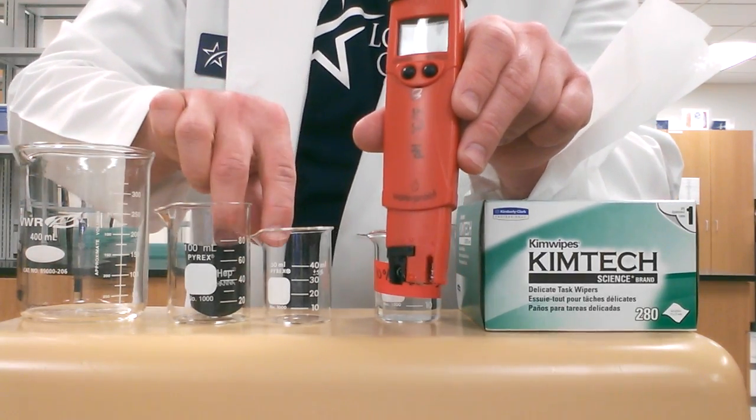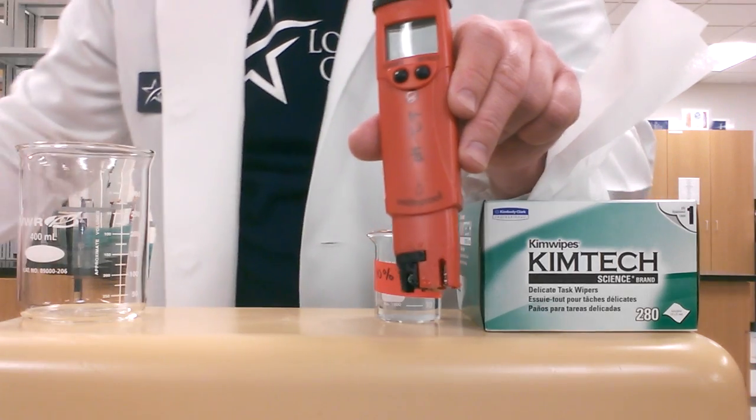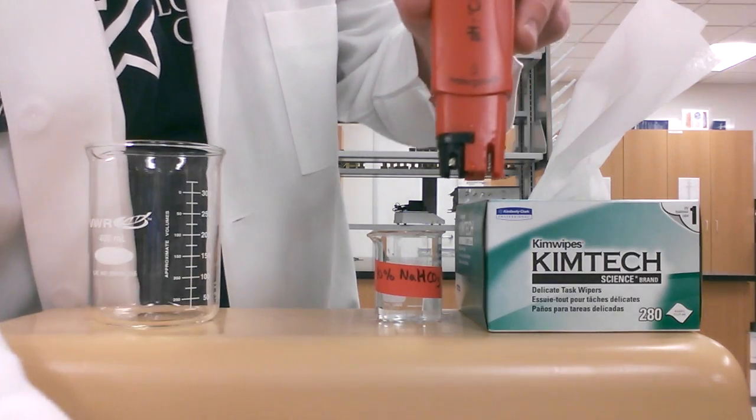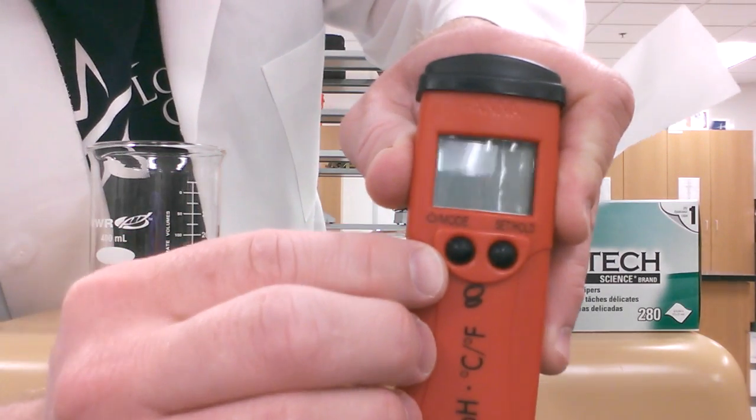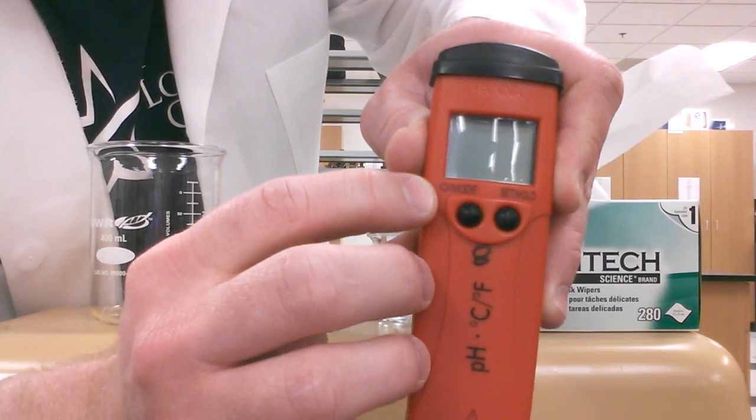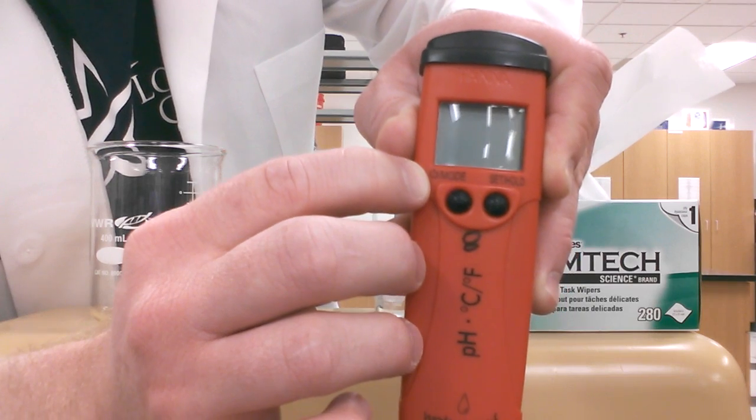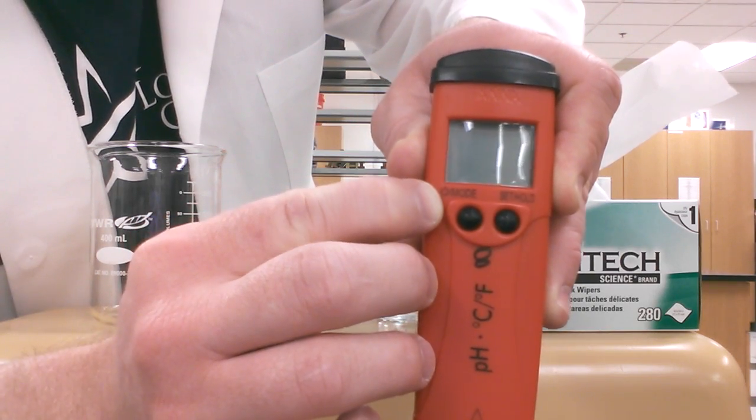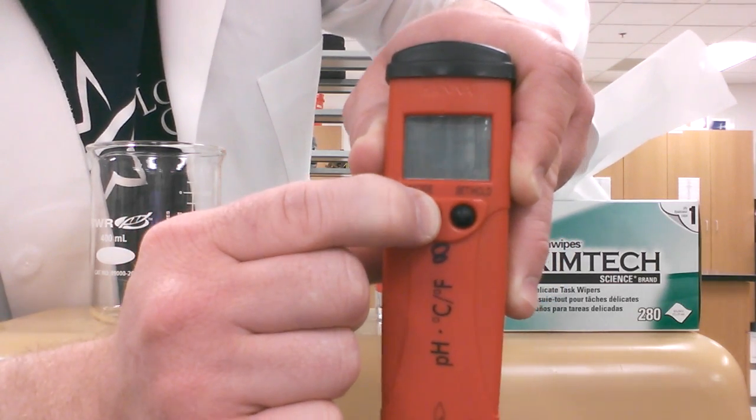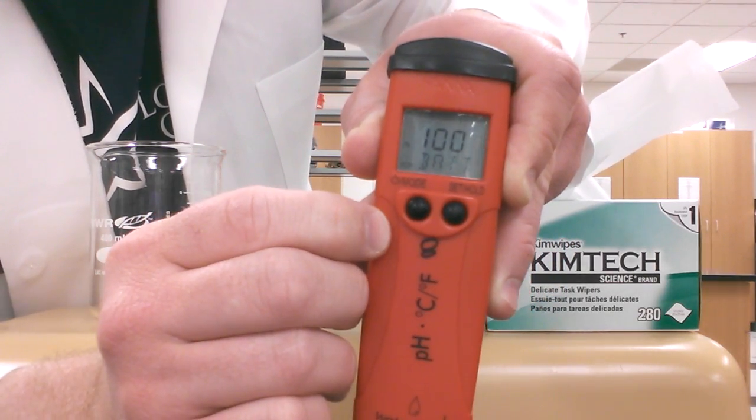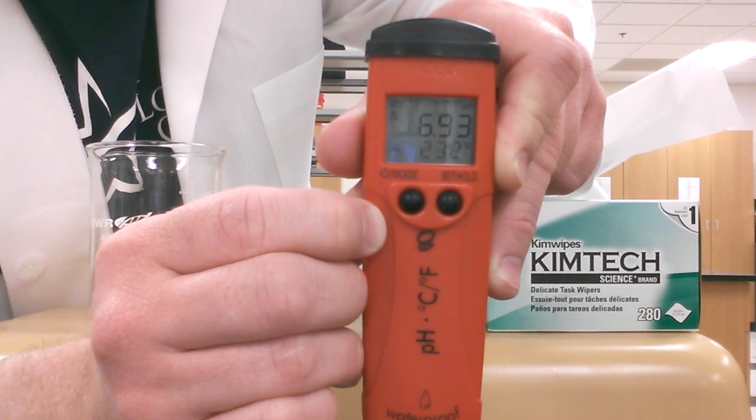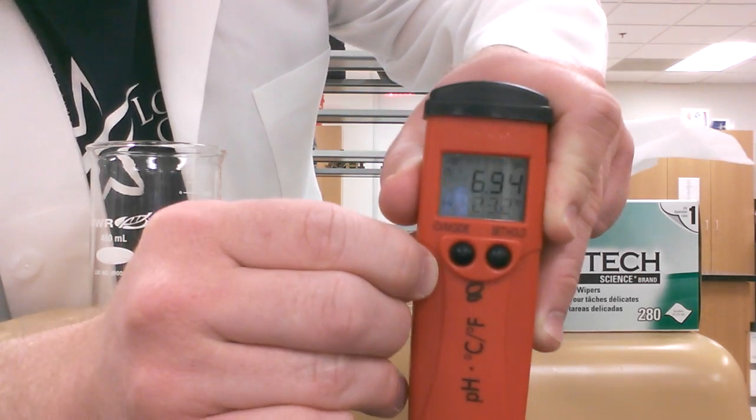Once we set that aside, we're ready to go. We're going to turn on the pH meter by holding down the power button. It has a circle with a small line through it, which most power buttons usually have, and the word mode next to it. We're going to hold that button down for a full second. There we go.